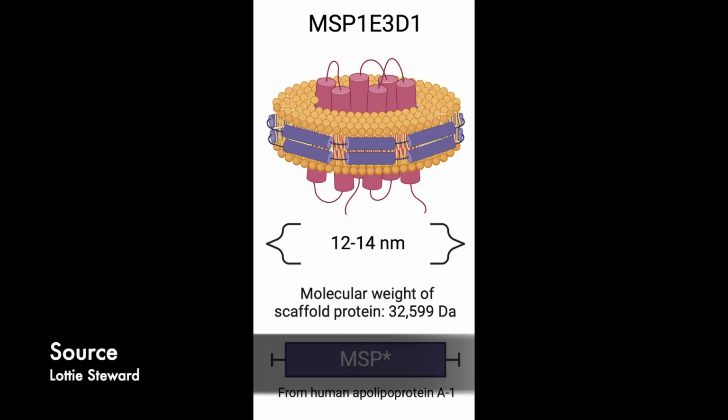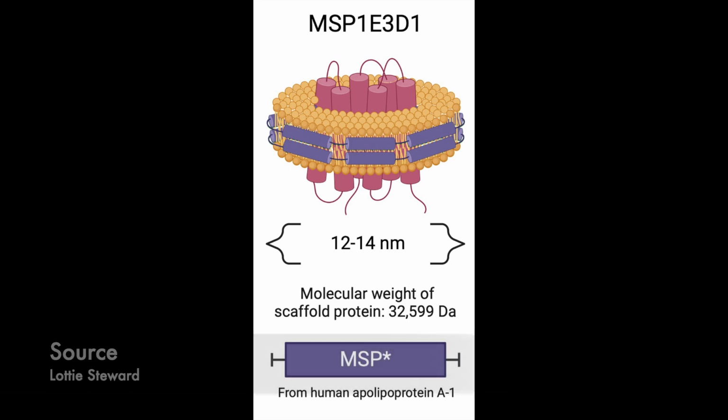We have the purified receptor, but there's still one more thing we need to do before we can start doing cryo-EM stuff, and that is we need to put a nanodisc around the transmembrane domain of the receptor. And what a nanodisc really is, is you have this MSP protein, which is kind of holding together this small collection of lipids, which a lipid is basically just something with a polar charged head, and then its tail is going to be a hydrocarbon or something that's non-polar, doesn't like interacting with water.